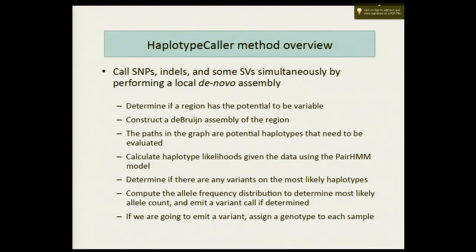So what's the minimum coverage for trying to do this? The question is the minimum coverage. We used it for 1,000 Genomes at 4x coverage, and we achieved very high accuracy. But the trade-off there is that you have lots of samples. So it's 4x coverage, but you have lots of samples, and that's what allows you to build these graphs. For the single sample case, we're working with coverage down to even 15x, and it looks fine. So I don't know. Is that an answer?